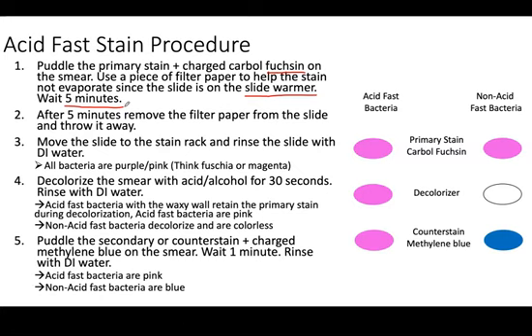So this is 5 times longer. But then we're also applying some heat source. So this varies with different acid-fast procedures, but when we carry this out in our laboratory, we use a slide warmer or a hot plate. And so 5 minutes of allowing the primary stain to really get forced in there. So remember the difference between these.